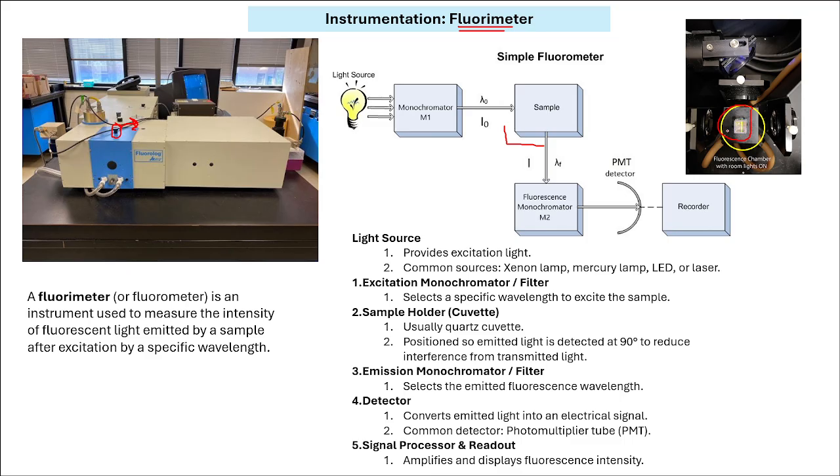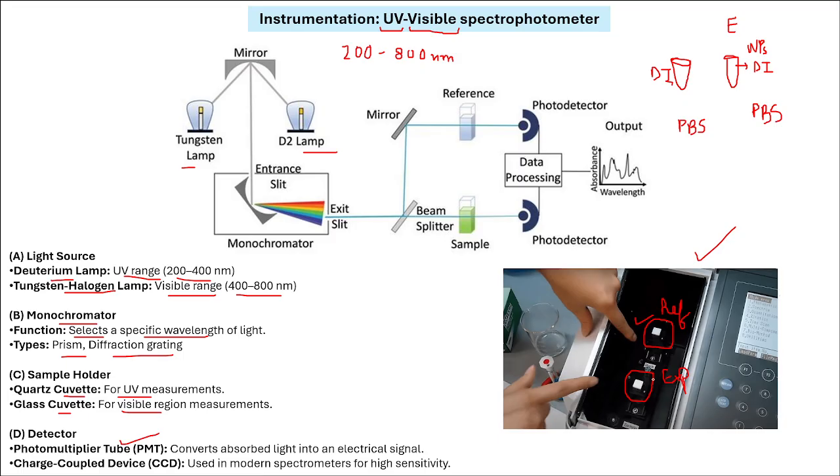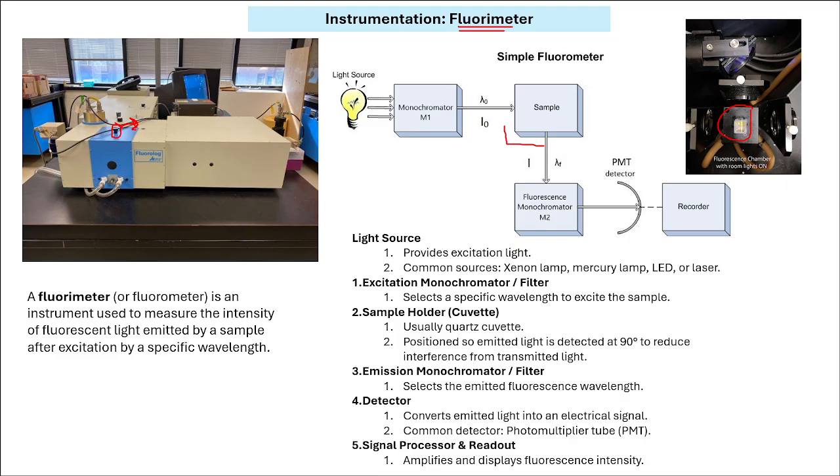One difference that you would have noticed here is that in absorption spectroscopy there was space for two cuvettes. We were putting two different cuvettes. Now in this case, you can simply put one cuvette. The light will come and it will go at a 90-degree angle, which you will observe. So this is the difference.